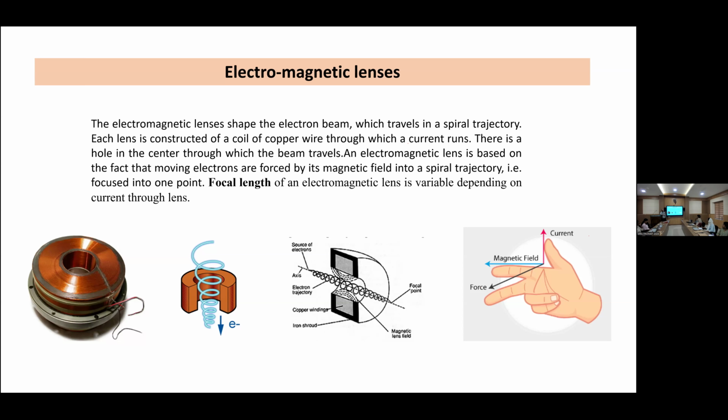If we normally use magnetic samples inside the TEM, in future maybe we will have problems with the lens. So the operator may struggle to get very good images. But in our lab, for 12 years, we have been analyzing magnetic samples. Because I am the only person handling it, I know the changes, so for me that is not an issue. But after some time, we may have problems with the lens, because our group is strong in magnetic study, so we have a lot of magnetic samples and continuously analyze them. But this is the reason people say we will not analyze any magnetic samples. That's it. It will affect the lens.